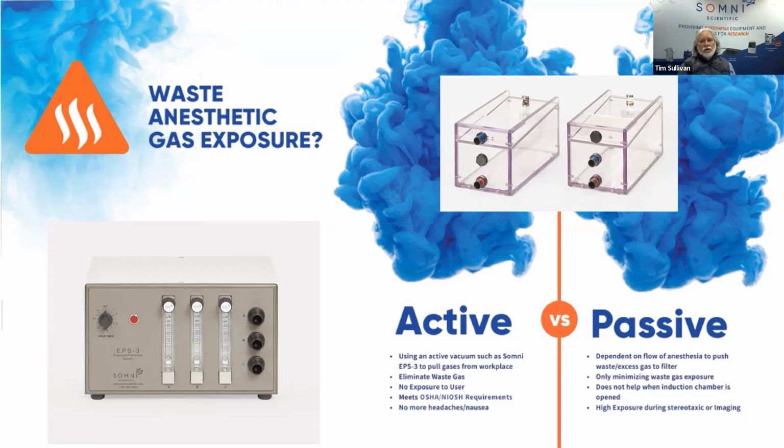On the passive system, shown on the right-hand side, the fresh gas pushes through the device, whether it's an induction chamber, nose cone, whatever, and then on through a tube to typically a charcoal filter.